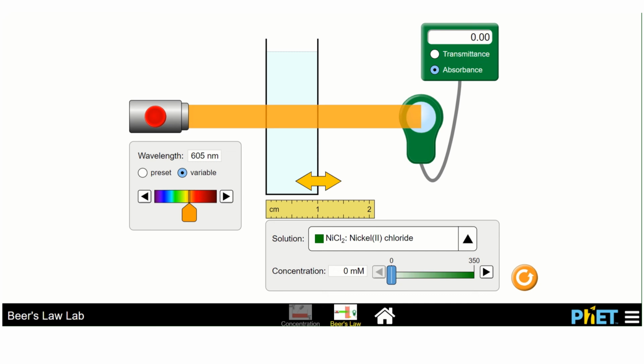That's step 3. Notice that the end of step 3 mentions continue measuring the absorbance for each 25 millimolar step until you have reached 300. So you're going to change this every 25. You're going to increase by 25 each time, or try your best. Like if it's 26, just take that measurement and then read the absorbance. It's hard, you can't change it by number. You have to move this thing. Or, yeah, you can change it with the arrow. See, I just remembered that.